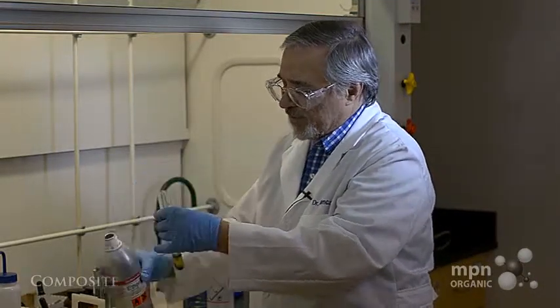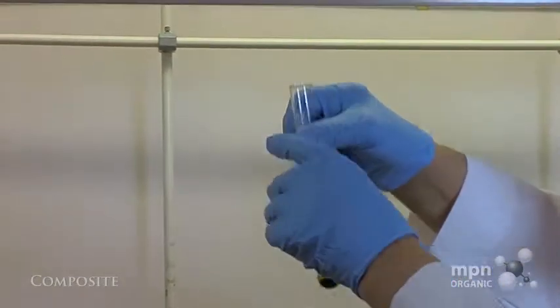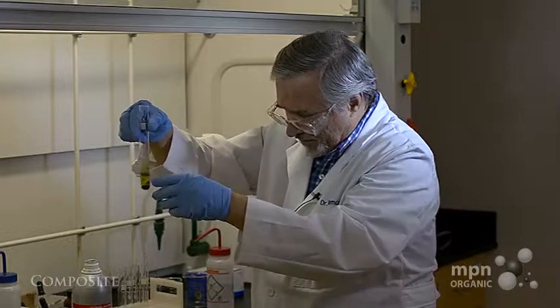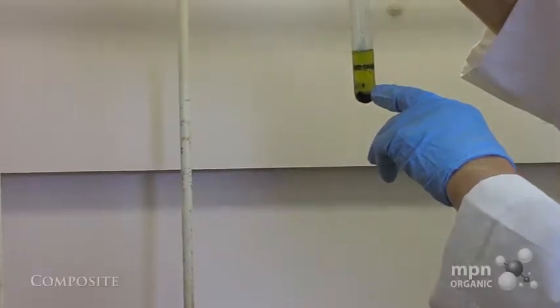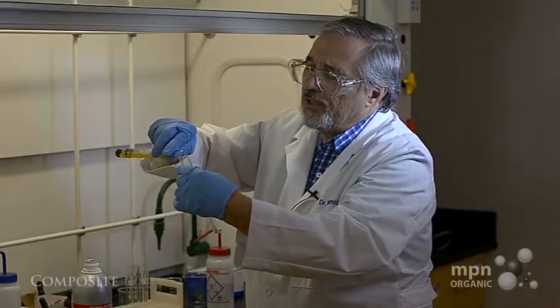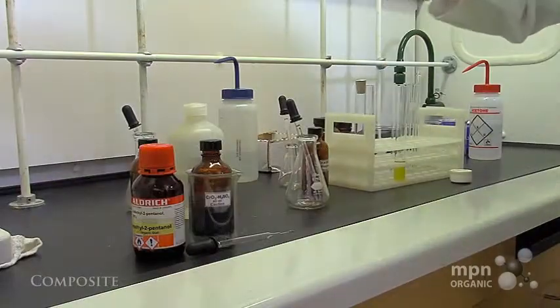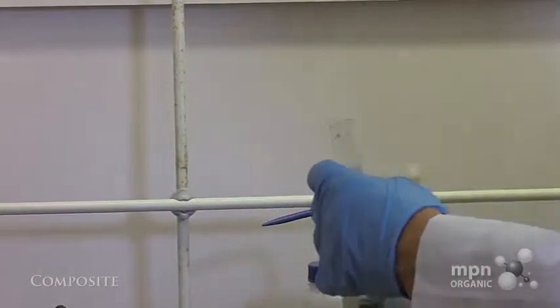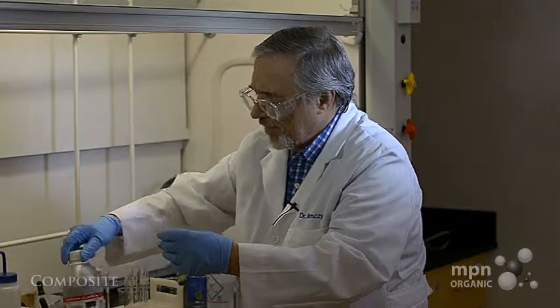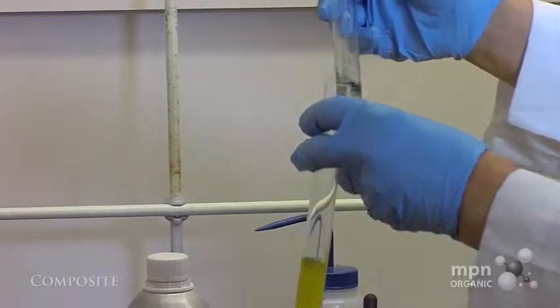Let's add a bit of diethyl ether here, and we should be able to see 2 layers, and in fact I do. You probably can't. Let's put a little bit more diethyl ether in there. Okay. So we've got 2 layers in here. I'm going to now take this solution and pour it into here. And I'm going to do this again. So we're going to do 2 extractions. And that should be enough diethyl ether. Let's take this, and now I'm going to pour this into here.